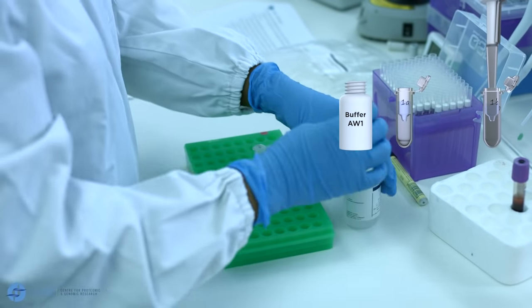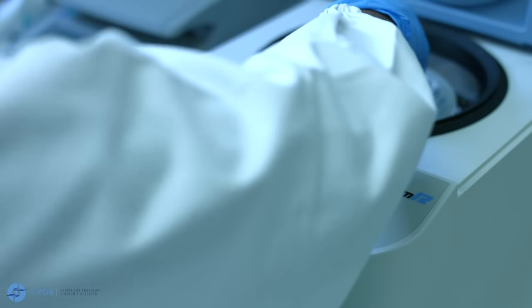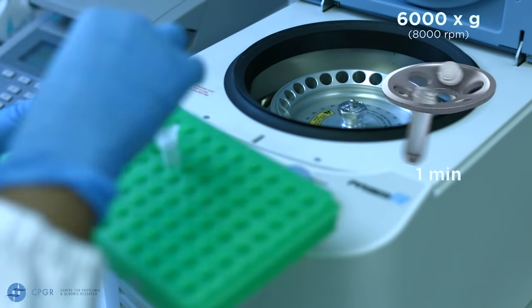Close the caps and return the samples to the centrifuge. And centrifuge for one minute again at 6000 g, that is 8000 rpm.